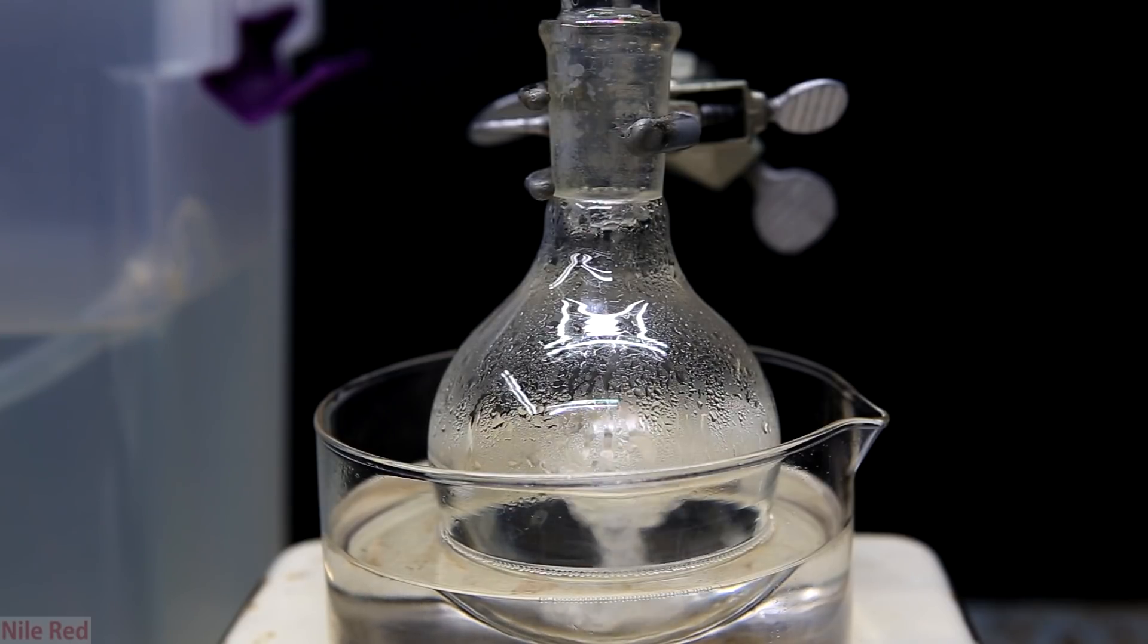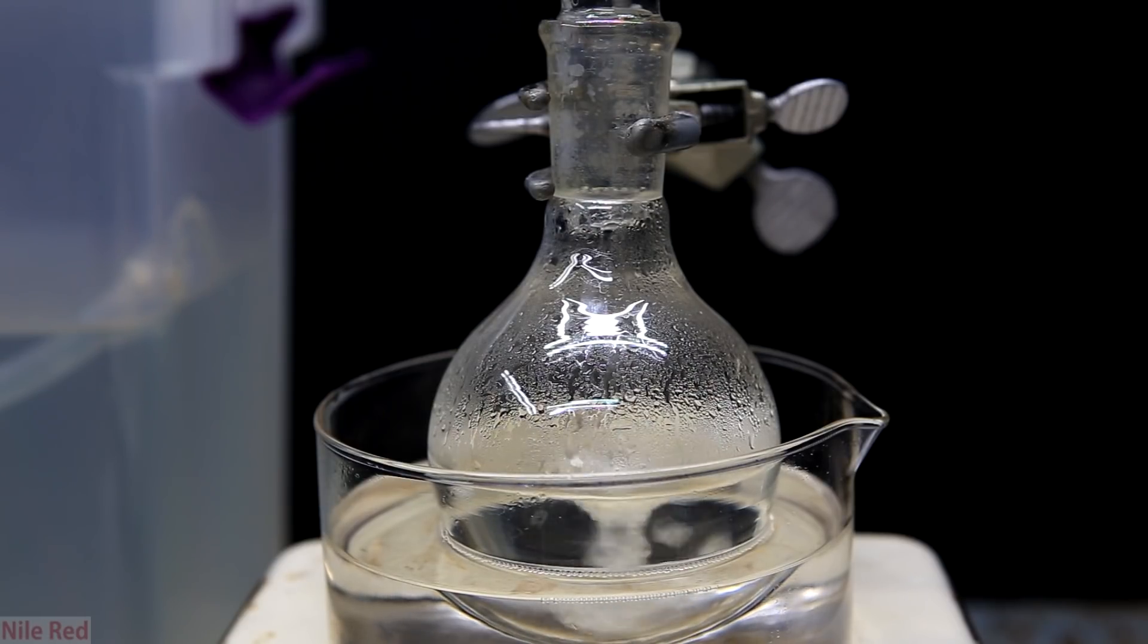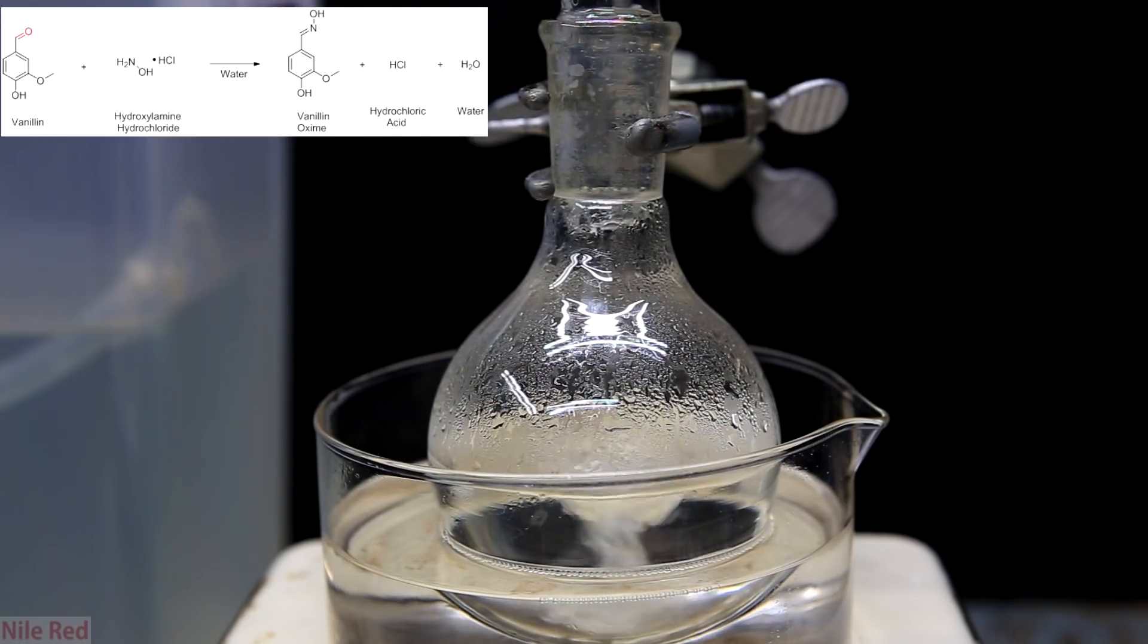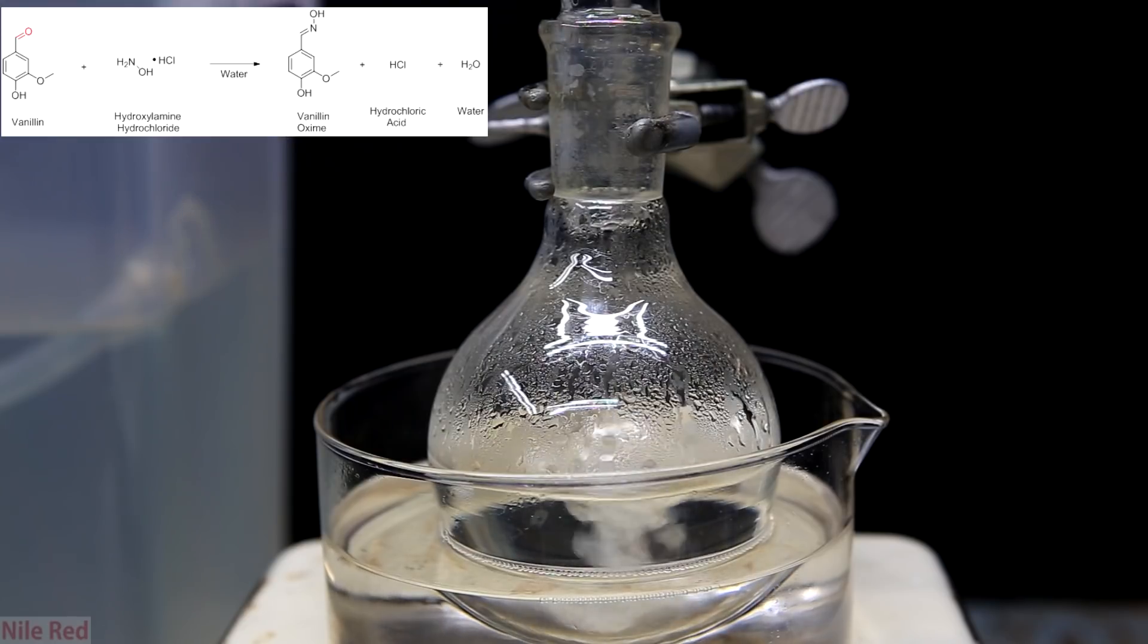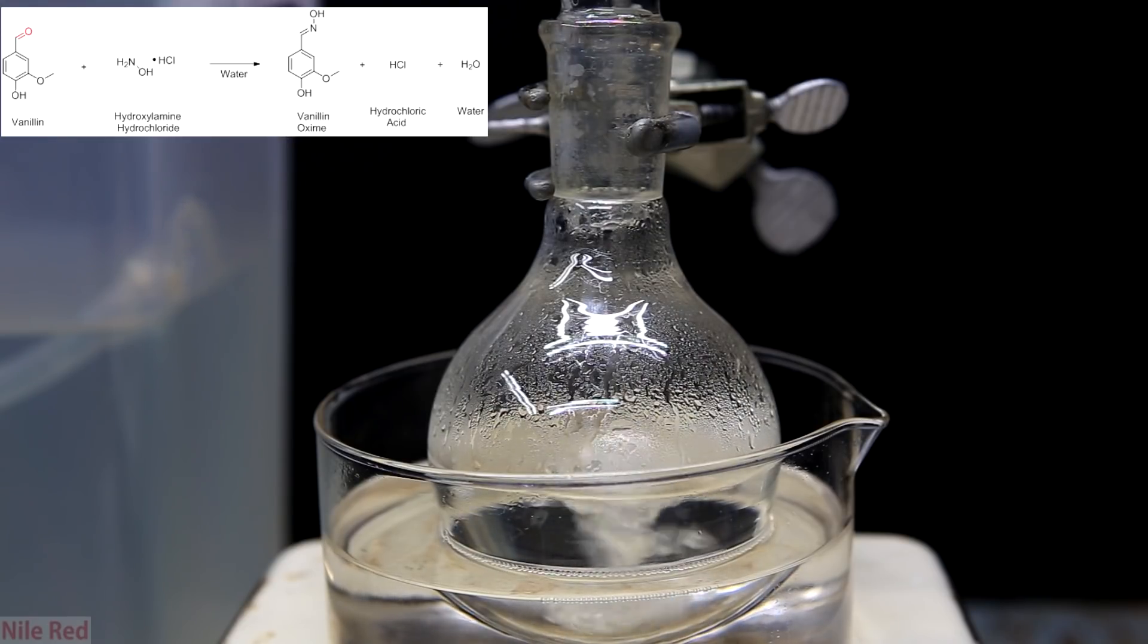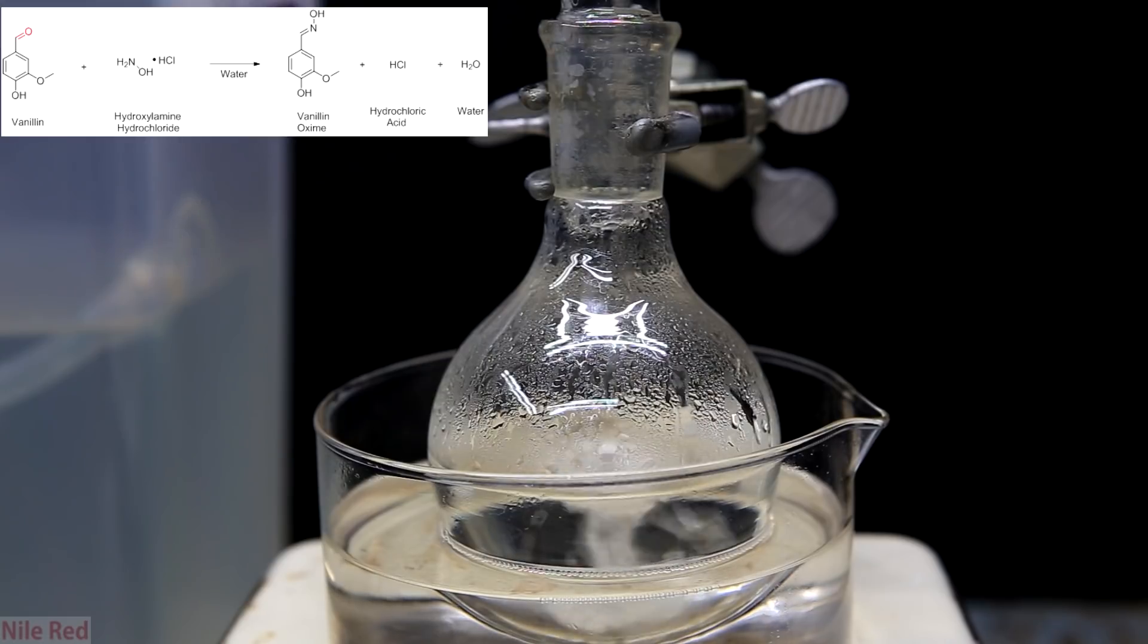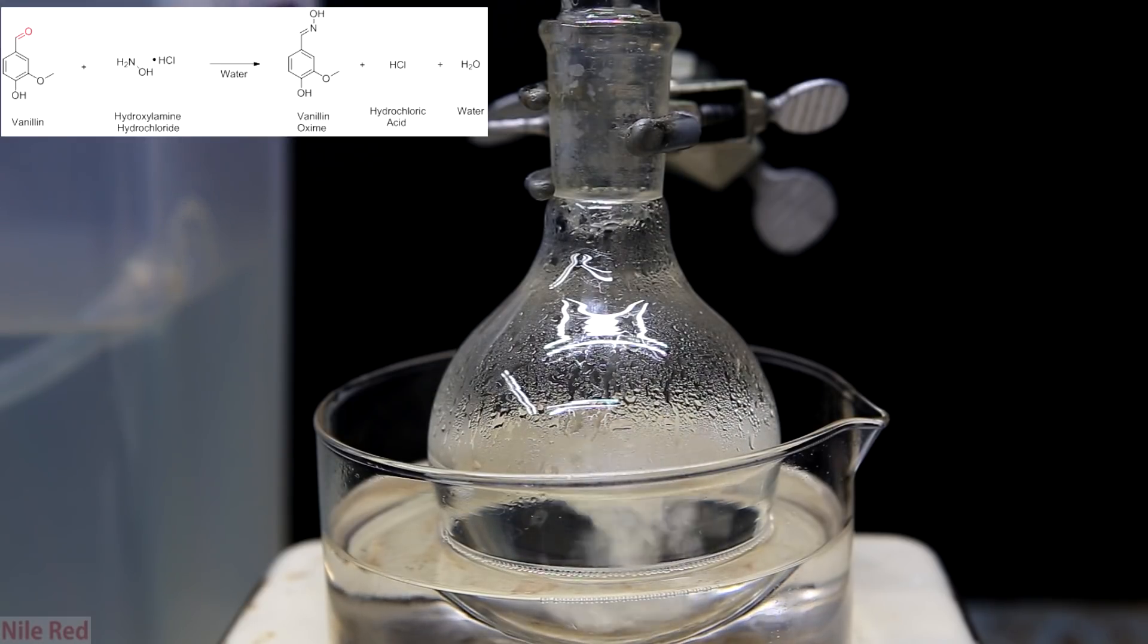Anyway now we'll address what's actually going on in the reaction. The vanillin reacts with hydroxylamine hydrochloride to form vanillin oxime, hydrochloric acid and water. One thing to note is that the HCl isn't really produced and it's kind of just released by the hydroxylamine hydrochloride. I purposely didn't include the sodium acetate in the reaction so I can make things more clear as to exactly what it's doing.